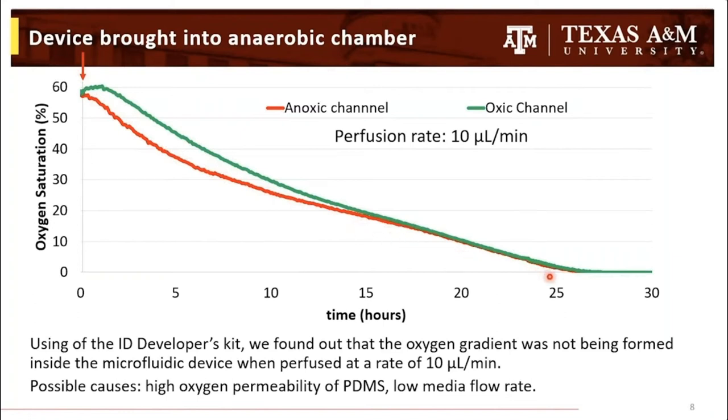until after 25 hours of operation inside the anaerobic chamber, when the system became basically anoxic, even though it was being perfused with oxygenated water. And so, thanks to the use of the ID developer's kit, we found out that the oxygen gradient was not being formed inside the microfluidic device as we expected when the device was being perfused at a rate of 10 microliters per minute.